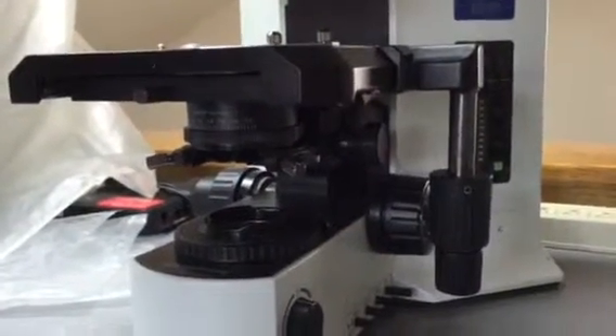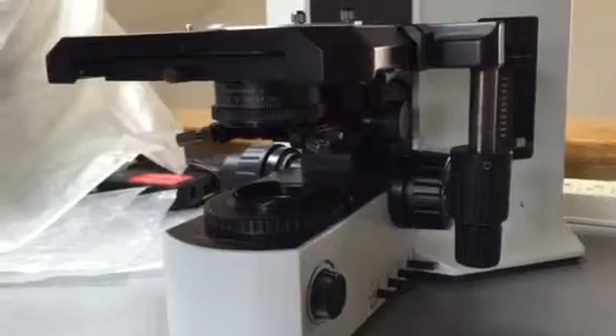Here's how we're going to replace the condenser on your Olympus Scope. You're looking at your Olympus Scope right now with the stage and the condenser below it.